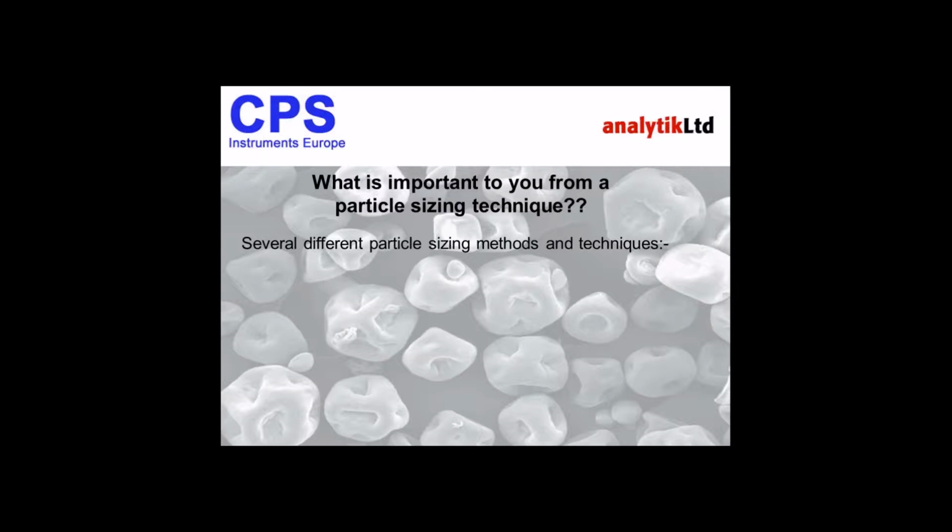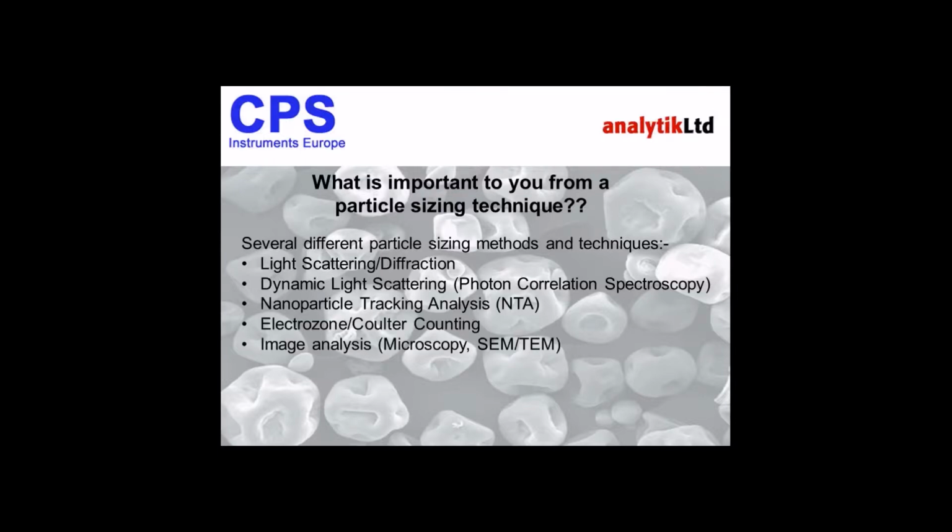As you know, there are many different sizing techniques available. What I've done here, I've listed most of them, and you'll probably recognize them all and may even have them in your labs and working environment. So what do we have? We've got a couple of ensemble techniques. These are where particles of different sizes are all mixed together in a chamber.